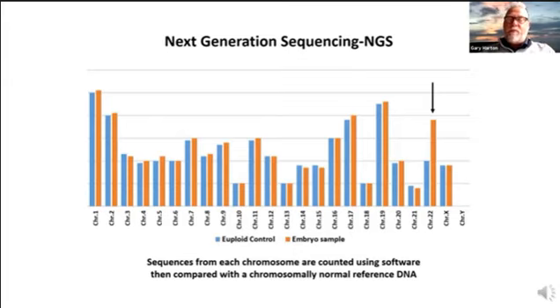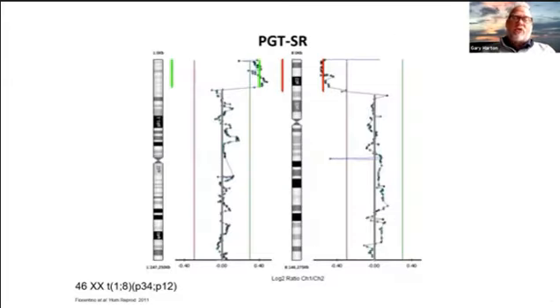So you take those chromosome counts. In most software, you can drill down to the chromosome level. So here you can really see where each of those pieces of DNA, where those bins are assigned. You can see that they don't actually come out in these perfect nice lines that we like to show you. The real scientists in the PGT-A lab, this is where they go when they want to really look at a chromosome and see how it's impacted. But you can see, because of the resolution, the system then allows you to look at, for this is a translocation, a gain or a loss on the arm of the chromosome, and you can see exactly where that gain or loss are delineated, either for a de novo segmental or in a translocation case.